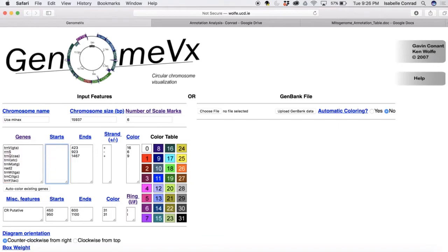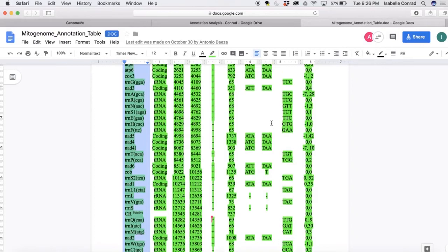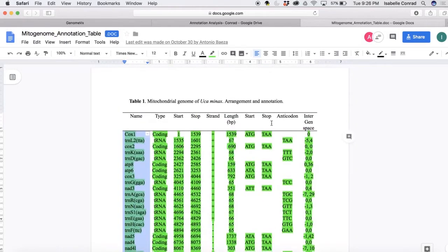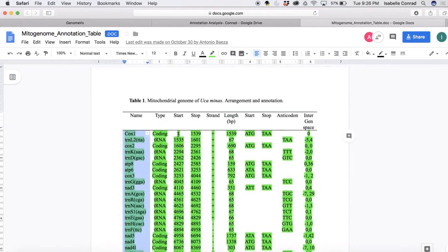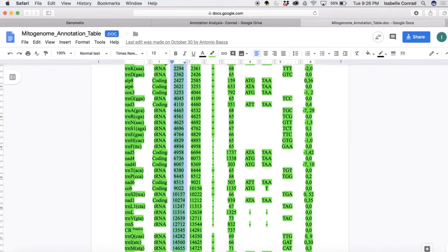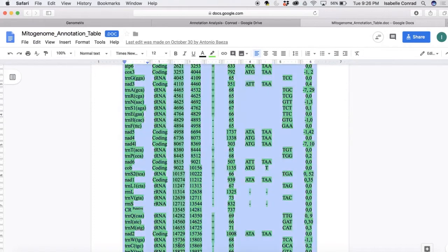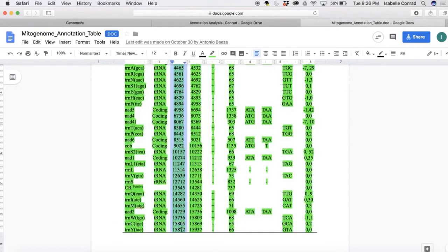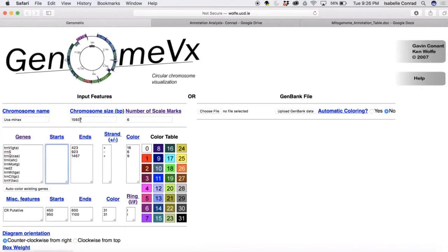Now we're going to put all of these start nucleotides into the start column. So you're going to copy your start column from your annotation table, just the start column, and then you're going to go back to the website and paste it under the start column. Again, delete the space that it pastes in there.